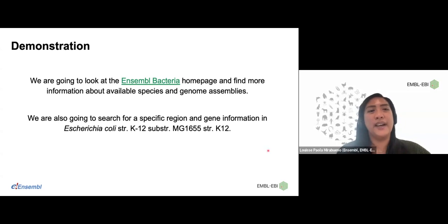The example species I'm going to use for visualizing a region is E. coli strain K12.